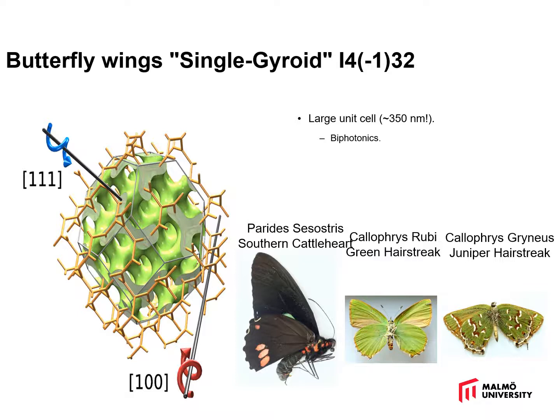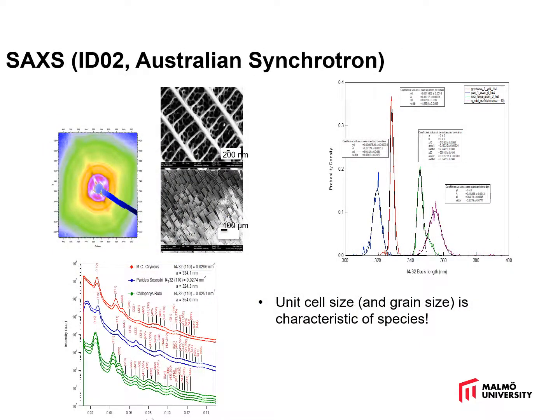It's so-called structural color. The periodic spacing causes an interference phenomenon with light, which gives these butterflies their green color. And of course, you can put these butterfly wings, in this case, in a synchrotron SAXS beamline, and get the d-spacings or the periodic spacings of the lattice in the butterfly wing from the scattering pattern. That's down in the bottom.